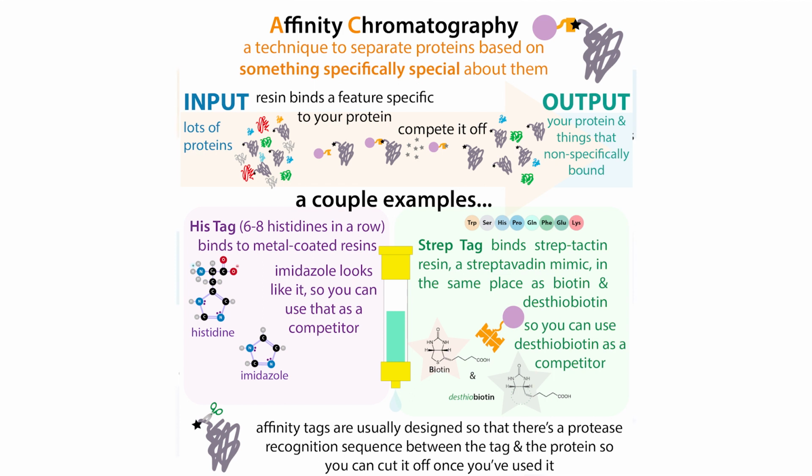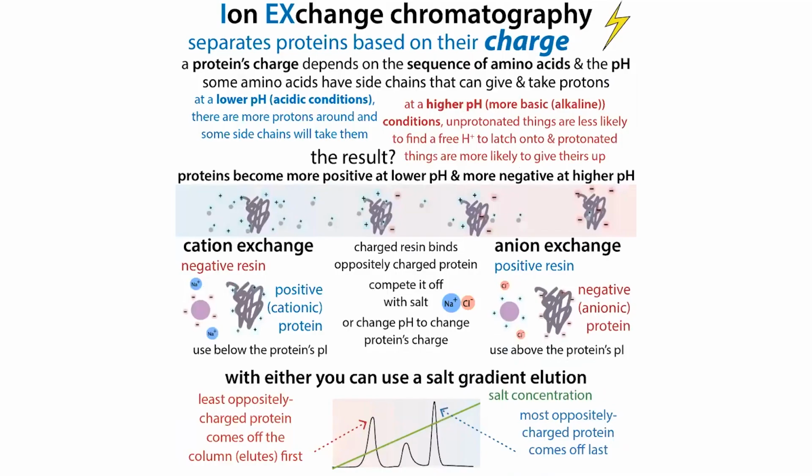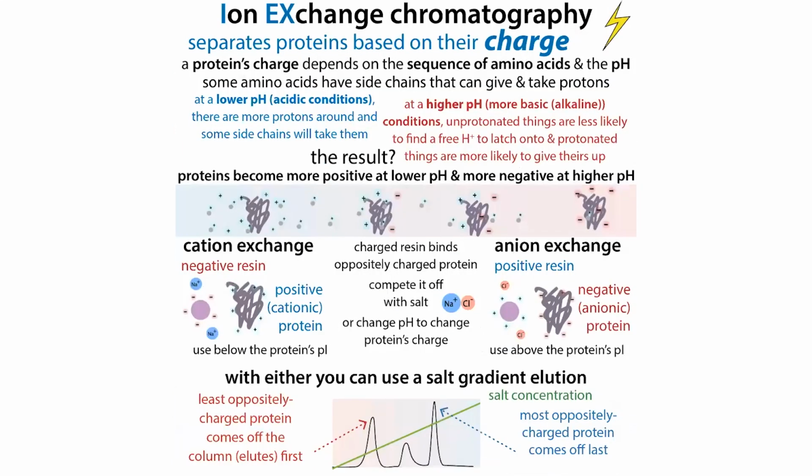And the more salt there is, the harder it is for those things to bind. And so you typically have a higher salt concentration in this affinity chromatography step. But then you have to dilute that down before you go on to that ion exchange chromatography step, at which you need to start at a low salt concentration, maybe something like 50 millimolar here, as opposed to, say, 300 millimolar of NaCl or something in your affinity chromatography step. And so you might need to experiment to see how low you can go without your protein crashing out.